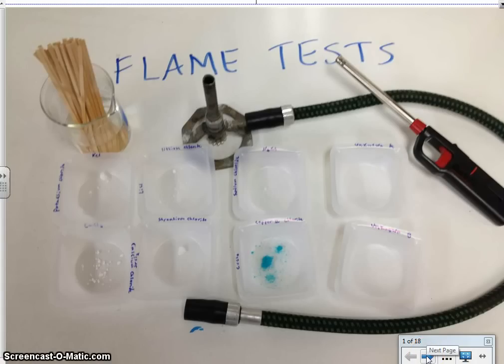This video is meant to be the pre-lab and the post-lab for the lab called flame tests. Just as a fingerprint is unique to each person, the color of light emitted by an element heated in a flame is also unique to each element. In this experiment, the characteristic color of light emitted by calcium, copper, lithium, potassium, sodium, and strontium ions will be observed.